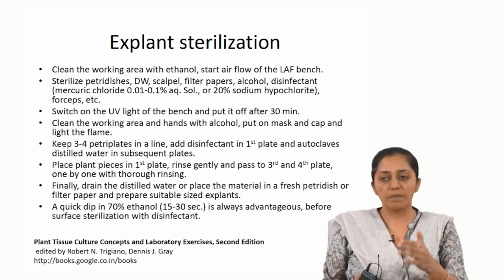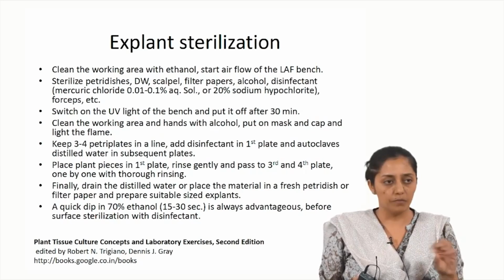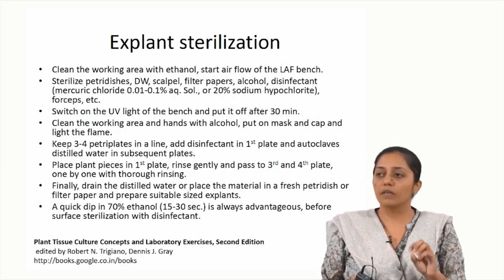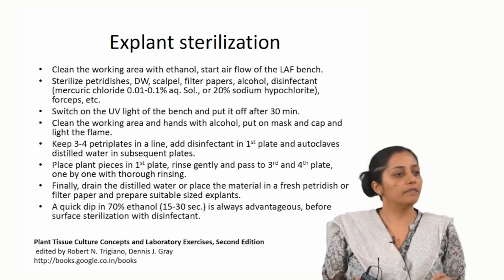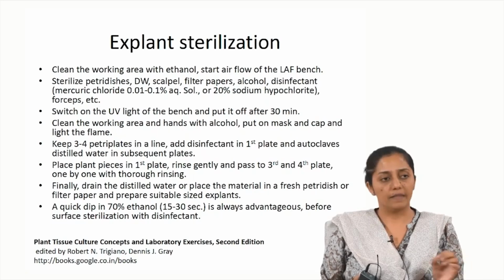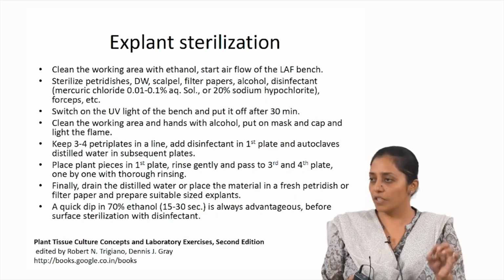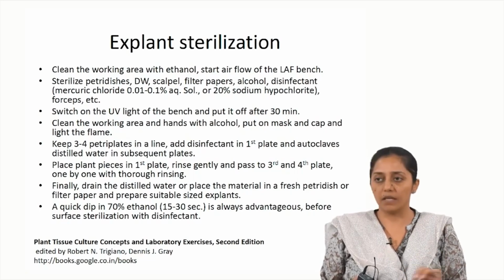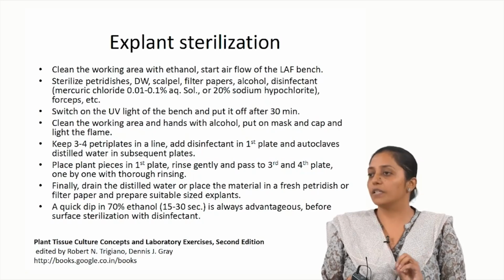Once the surface contaminants have been removed by water wash, before you treat it with the disinfectant, there is a treatment given with the wetting agent for 15 to 30 seconds. Then after treating it with the wetting agent, the ethanol is removed by water wash. Intermittent water washes are given for every treatment, and after that you treat it with disinfectants.